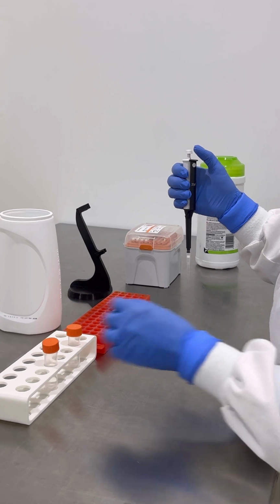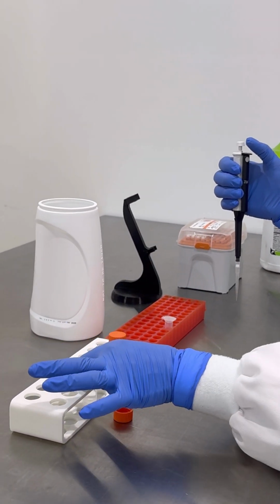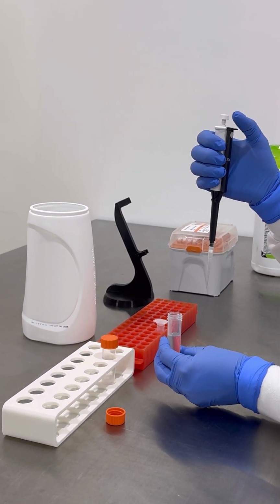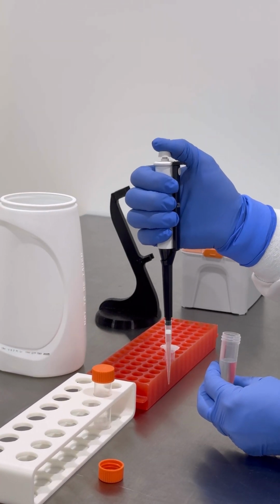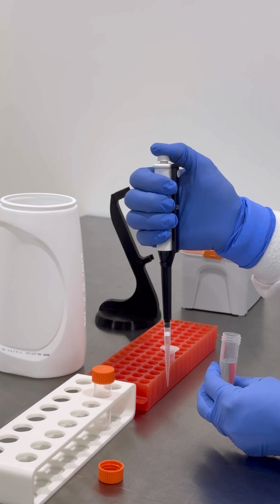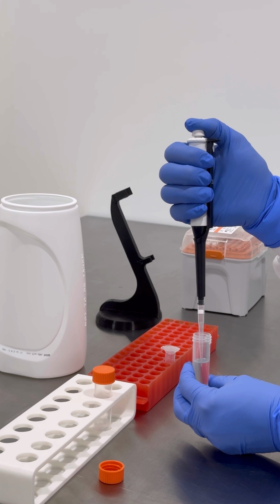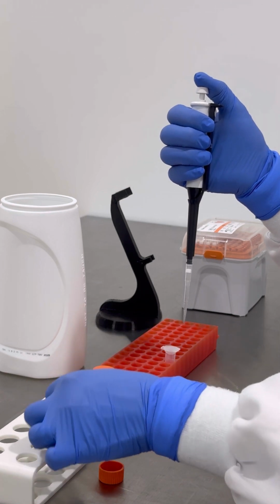Using your free hand, place the sample tube lid upside down on the bench. Now pick up the open sample tube without touching the top and inner edge of the sample tube. Press the white button on the top of the micropipette down to the first stop and hold. While holding at the first stop, place the tip into the top layer of the liquid in the sample tube. Slowly release the white button upwards to draw up the liquid. Lift the tip out of the tube. Place the tube back into the rack and sit the lid on top.